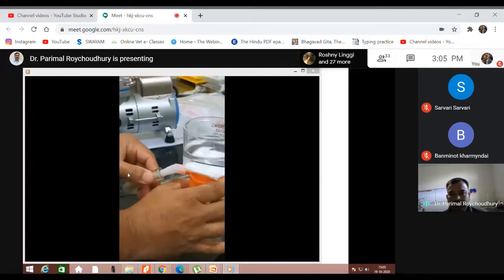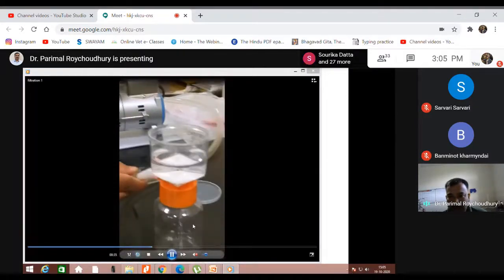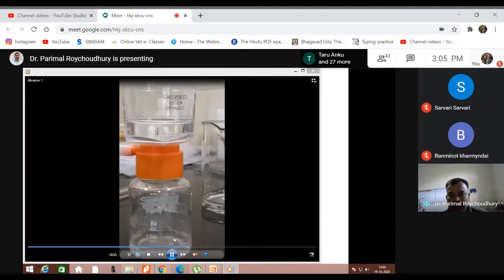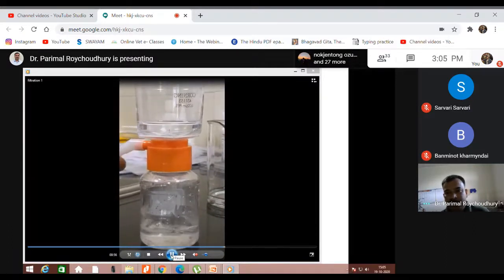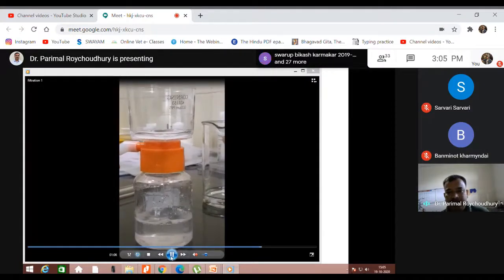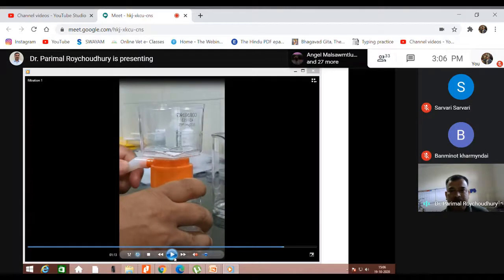Now I'm fitting it to the vacuum pump, and this is a suction pump. I switch on the suction pump. You can see the filtration rate. Can you see here? Very rapid filtration, the water is passing through this membrane. So this media is now totally free of all types of bacteria and fungi. Just switch it off. If I don't use this suction pump, it would take a longer time, say a few hours, to complete the filtration. But here, within 1 to 2 minutes, we can filter it.